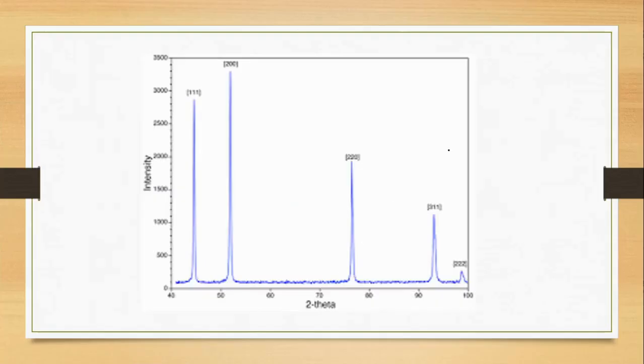And when you do the XRD, this is the output you'll get. So you can see, as I mentioned earlier, about the 2 theta, because we're taking account of both the incident beam and the diffracted beam. And this is how intense this diffraction is. And up here we have something called the Miller indices. This is to do with the crystallographic planes.